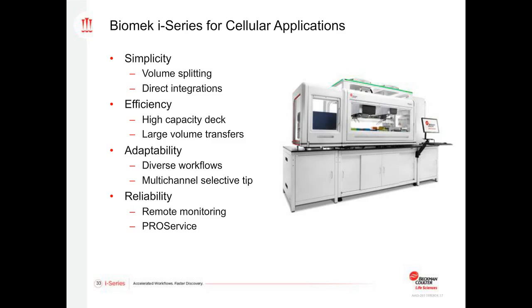Whatever the results from the Biocel come back, we can always just have it split the number of transfers it needs to get the correct volume. Also, having the integrations be more direct. Obviously you can fit a lot of instruments in a smaller footprint, not requiring any additional robotic transports to access these devices, which really increases the simplicity of those types of integrated systems.